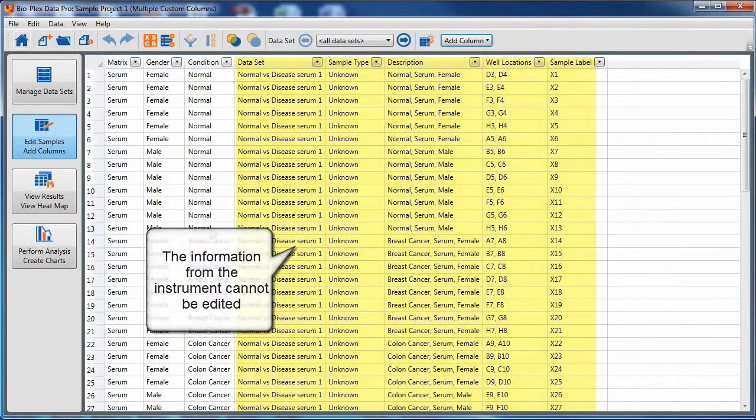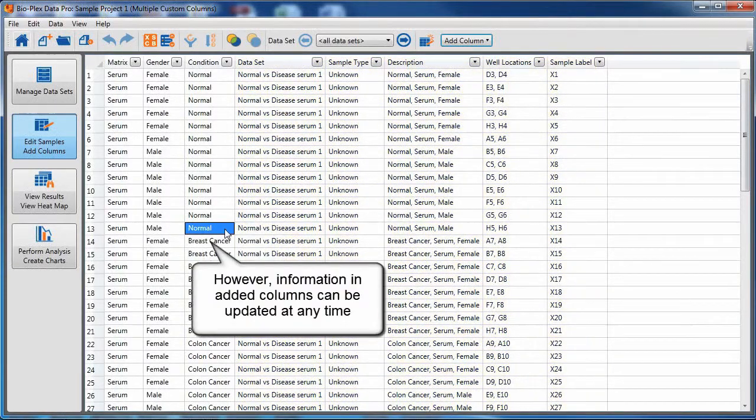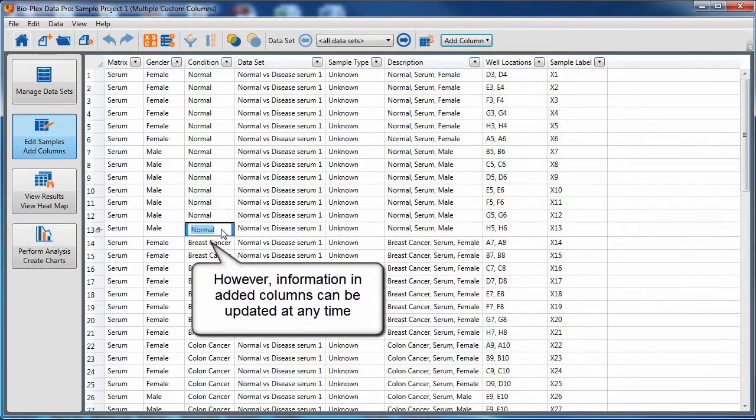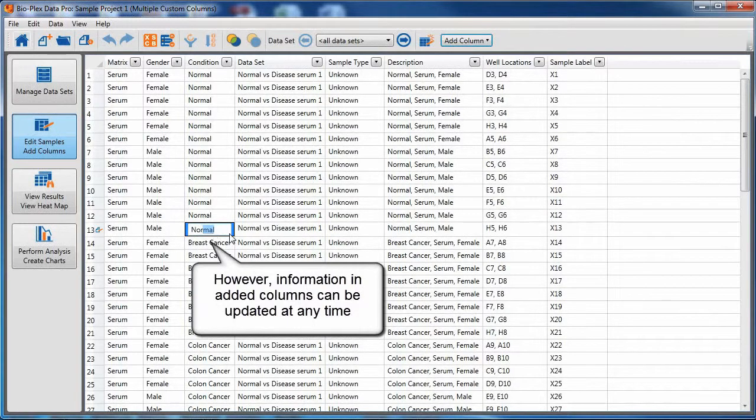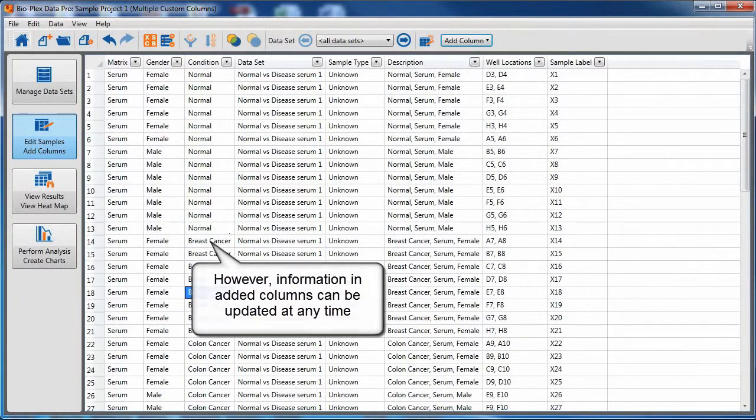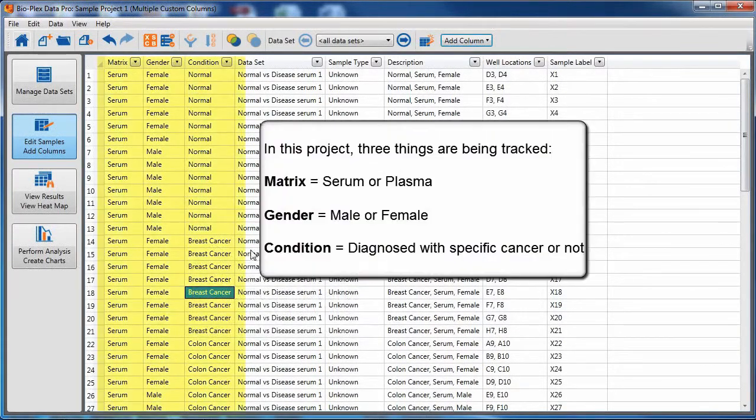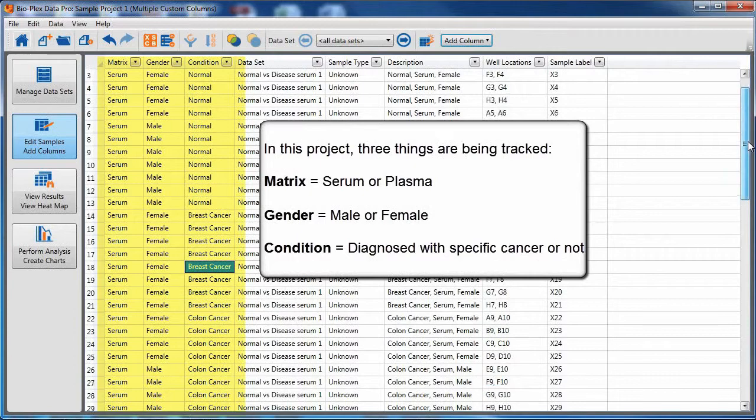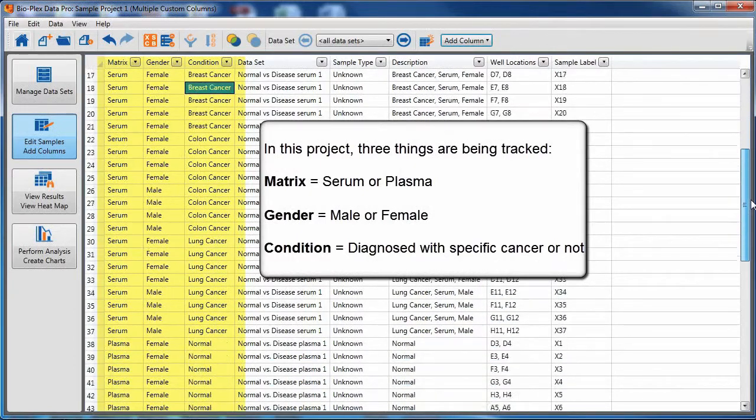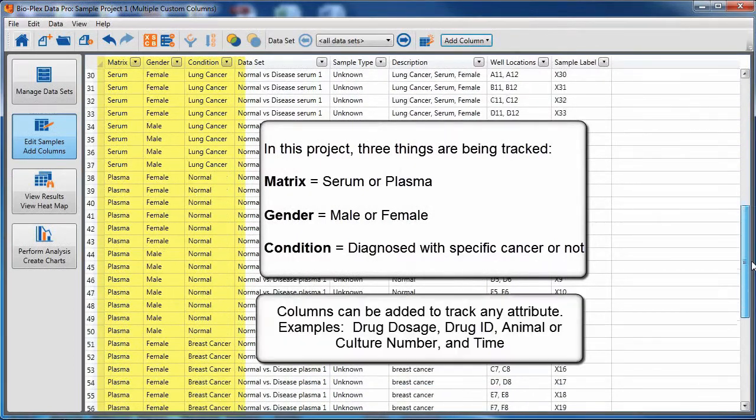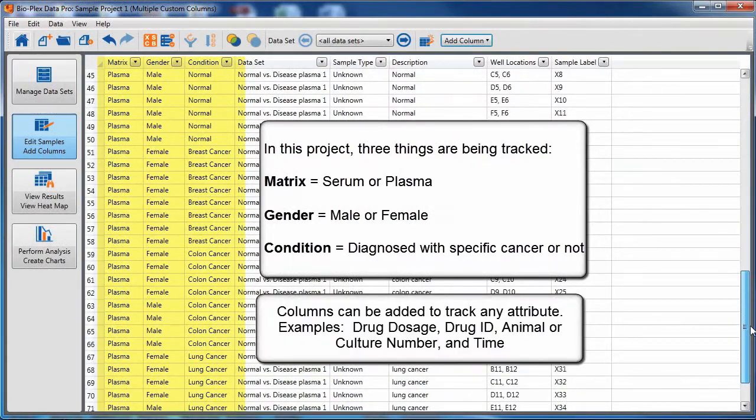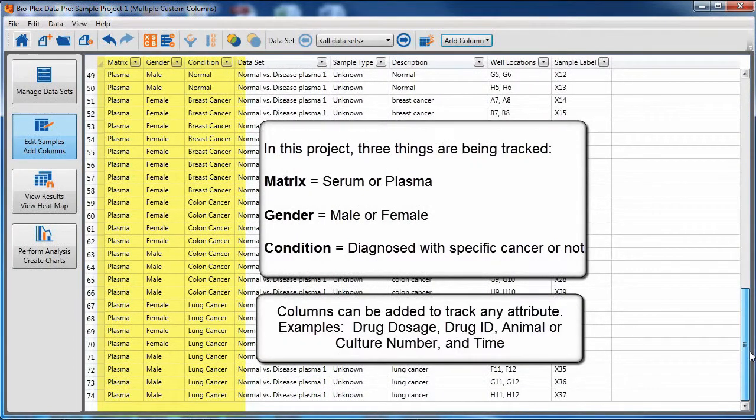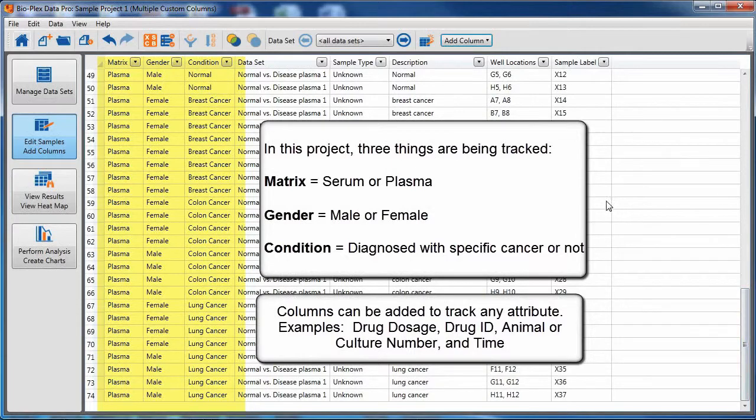Information from the instrument on the right cannot be edited. However, information in the added columns can be updated at any time. This project tracks three things: the matrix, the gender, and the diagnostic state of the individual from which the sample was collected.